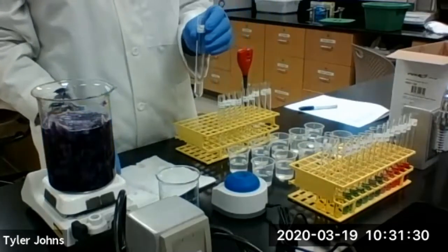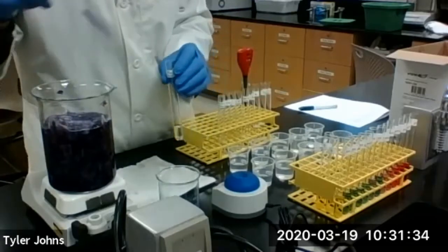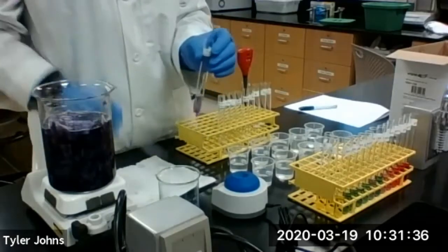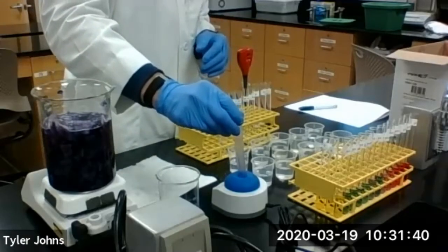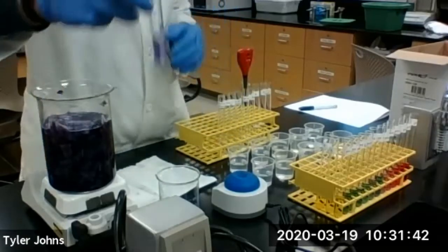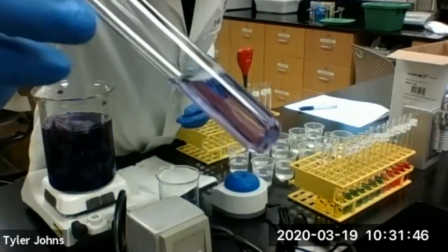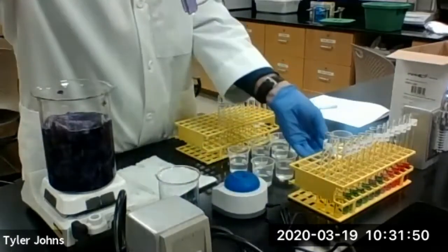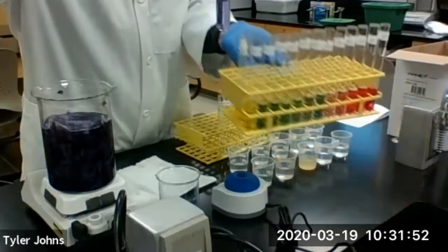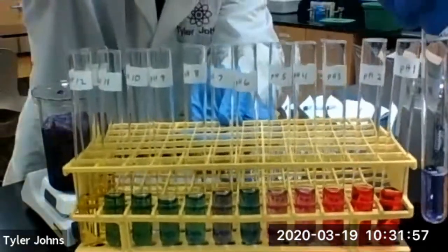Now we'll be testing tap water. We added our cabbage juice indicator to the tap water. And once again, compare to your cabbage juice references.